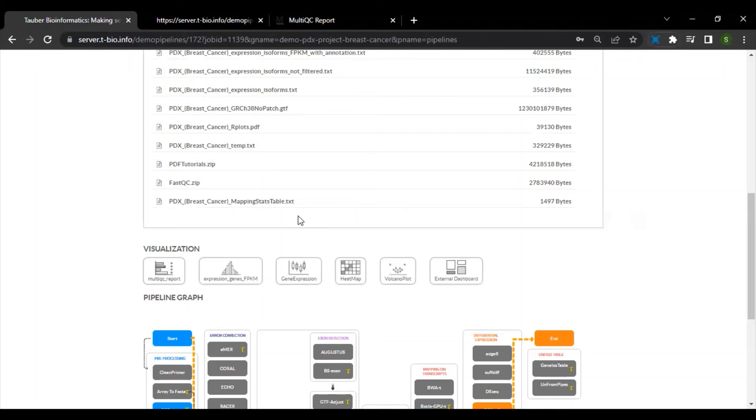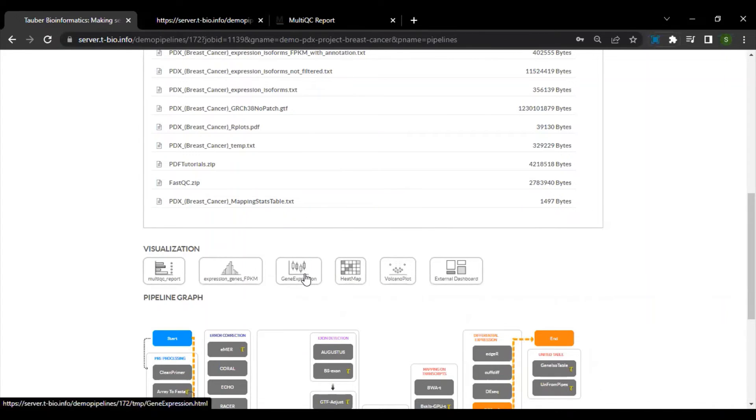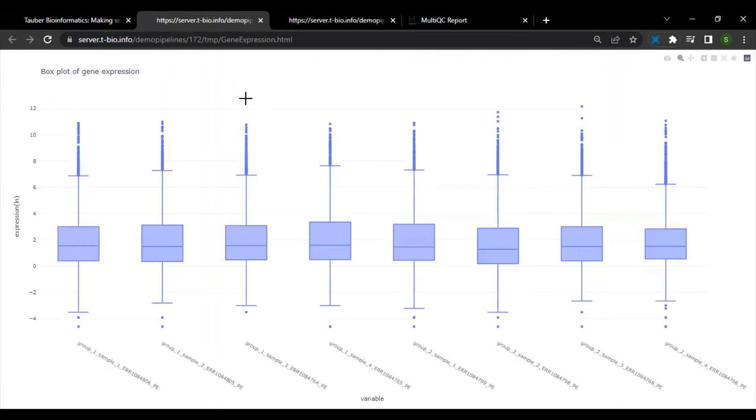We can also look at other graphs and see what they say about our samples. Here we can see the overall gene expression of our samples represented in the form of a box plot.